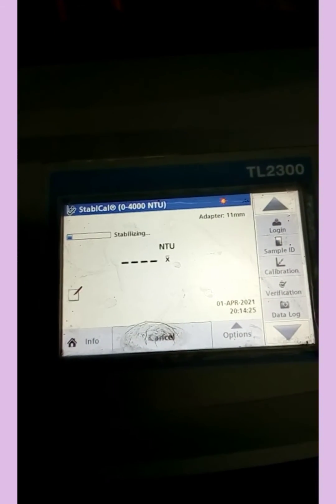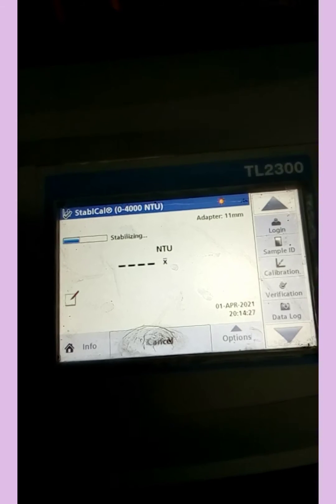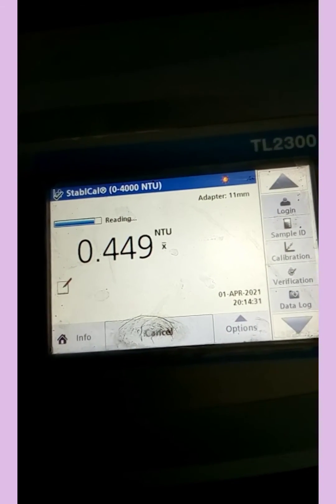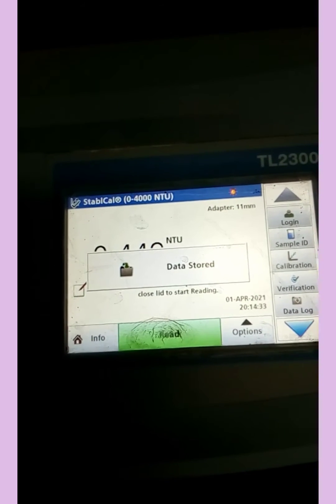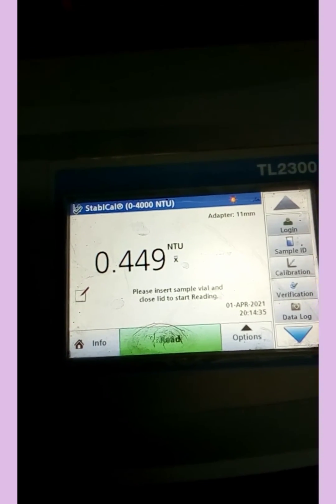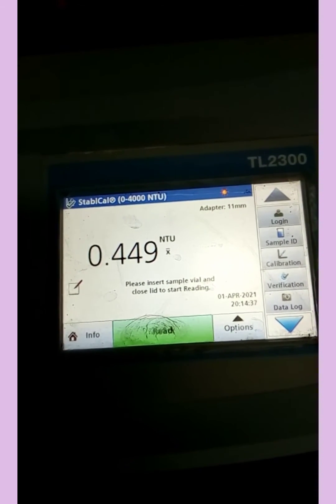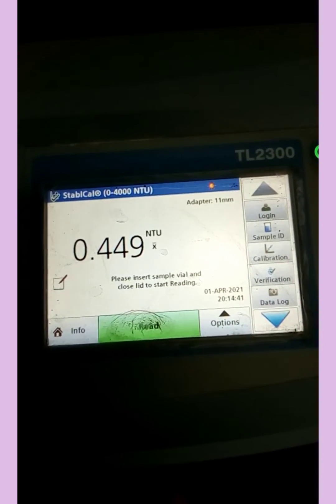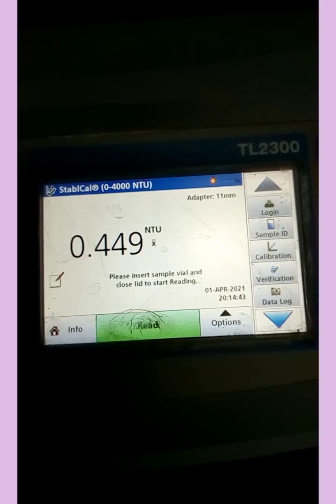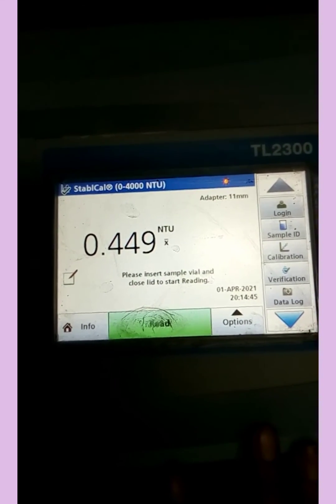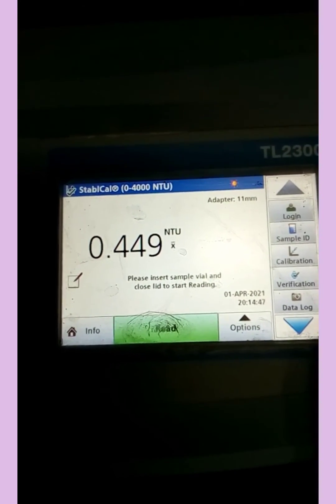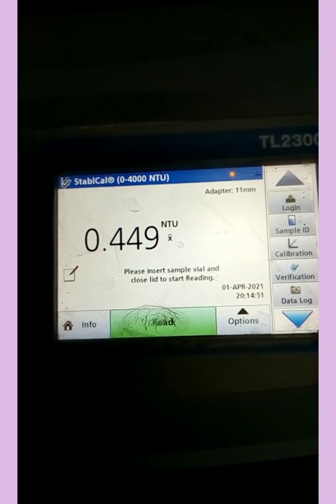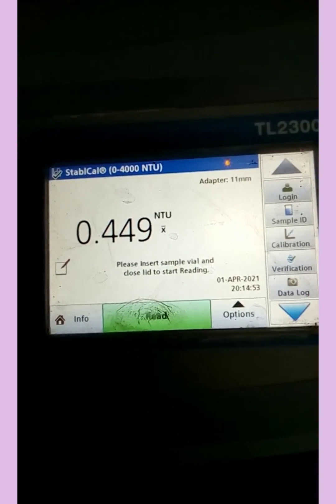The reading is stabilizing and displaying the result. The turbidity of my de-mineralized water is 0.449 NTU — less than one NTU. In the next class, I will show you how to calibrate the turbidity meter. That's all for today — stay blessed.